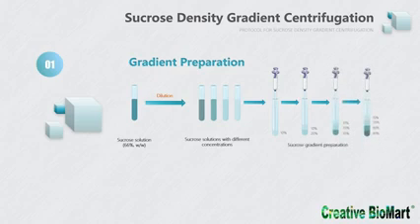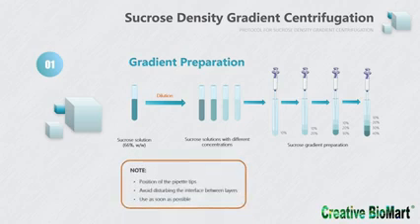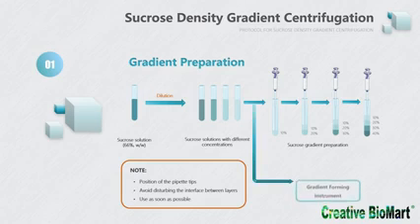30%, and 40% solutions successively. It should be noted that when adding the higher concentration of sucrose solution, the tip of a pipette should be placed in the bottom of centrifugal tubes, taking care not to disturb the interface between the layers. In addition, try to use a cold solution to prepare the gradients, and the prepared gradients should be used as soon as possible to avoid premature diffusion of the gradient layers. Gradient preparation can also be performed with the help of gradient forming instruments and the accompanying manuals.